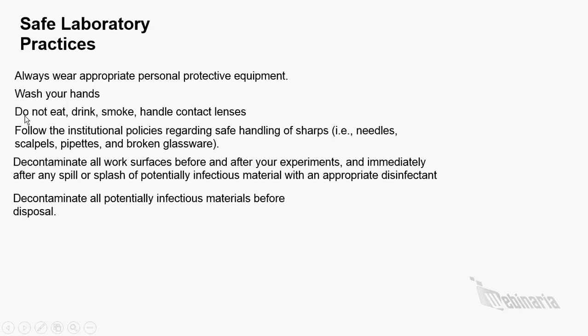Do not eat, drink, smoke, or handle contact lenses when you are working in the lab, or apply cosmetics, which is very common in girls, or store foods for human consumption in the laboratory. Okay, you don't have to eat biscuits and cookies and juices in the lab. Follow the institution policies. It's very important to take care while handling needles, scalpels, pipettes, and broken glassware.